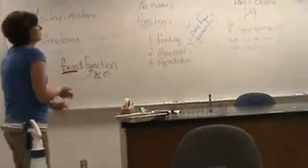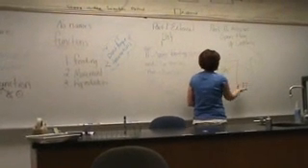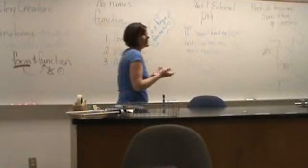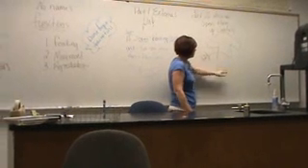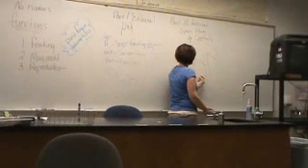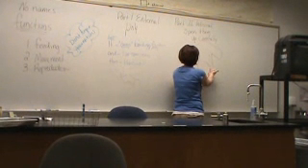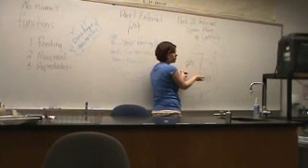All right. And so you give them the instructions that now it's time, we're going to open them up. The easy way to open them up is to flip it to the side that has less pigmentation, less spots. And then you'll notice it kind of looks like this tube sticking down. So what you want to do is gently put your finger under and the scissors, and lift this outer covering and cut here up as far as you can, and then just fold that over, and that will expose the internal organs. Be careful so you don't damage them.